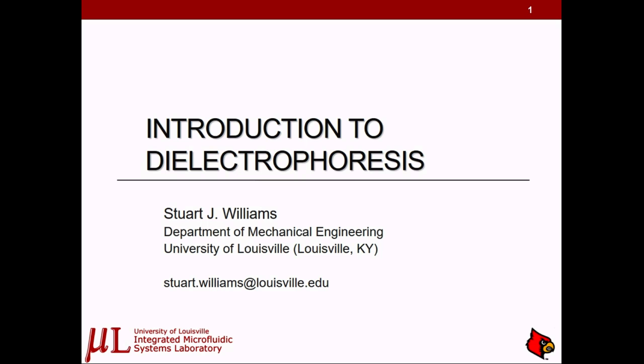So let's just draw a microscope objective here to view what this particle is doing. But we want to hold it still. But he also did not want it against a surface. So we got rid of that. Now, there was some magical force field, so it didn't want to come in with clamps. So there's some magical force to hold this in place.